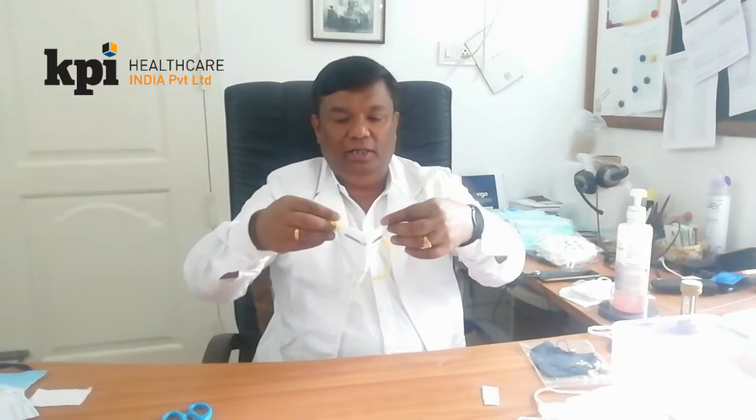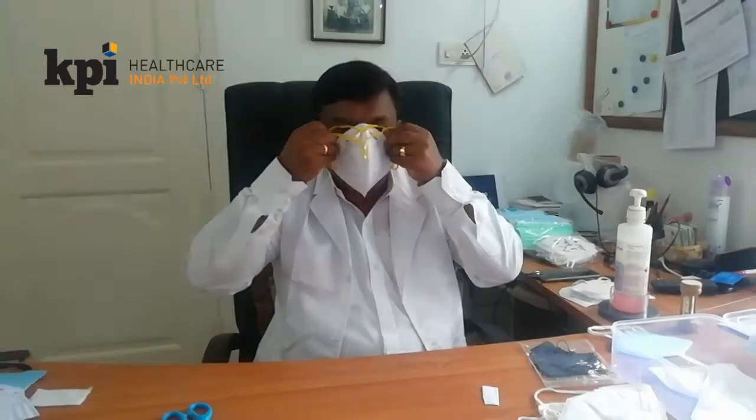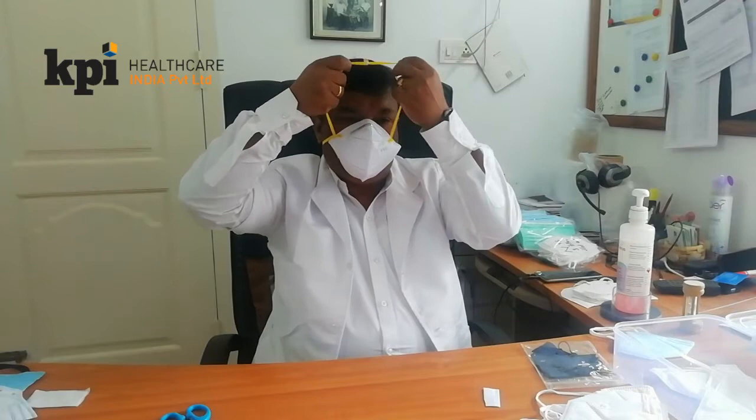It has a locker, and it has a nose panel. To put it on, I touch it here and open it here. Then I place the bottom strap first and the top strap on the top side. After placing the top one, you take it down to the downside.